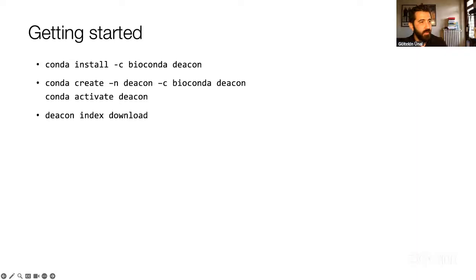Thank you. Last question is, how does Deacon complement adaptive sampling tools for ONT metagenomics, Oxford Nanopore technology metagenomics? How does it complement?